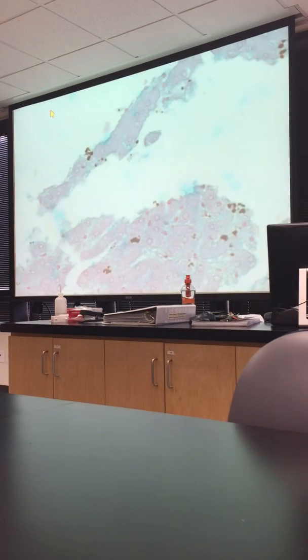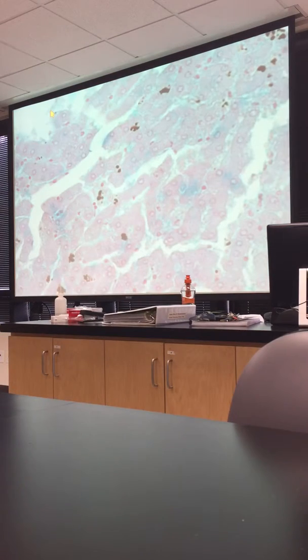And here it is under oil immersion. Okay, so it's crazy looking, right? That's anthrax. I just think it's super interesting because it killed lots of people. Not like that. I mean, maybe that sounds really creepy, but you can tell it looks nothing like a lot of the bacteria we look at, right?